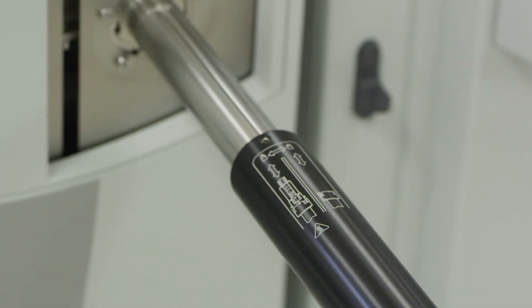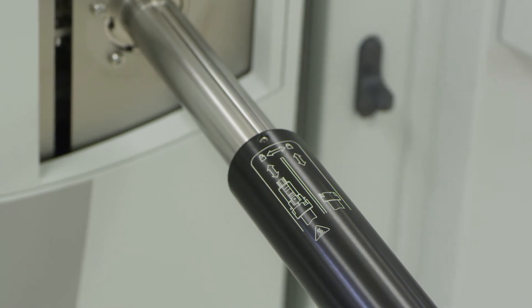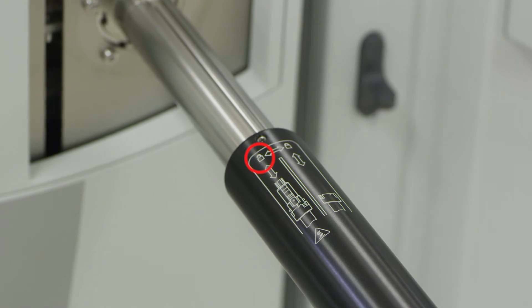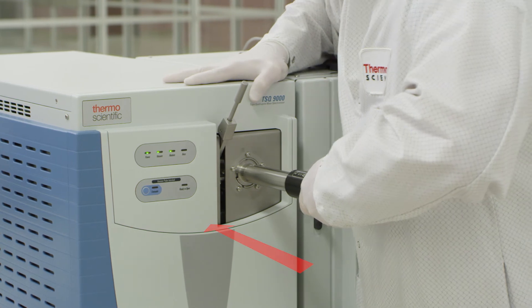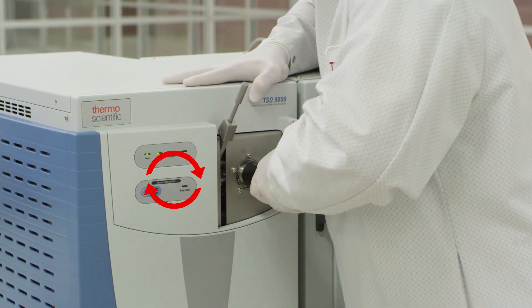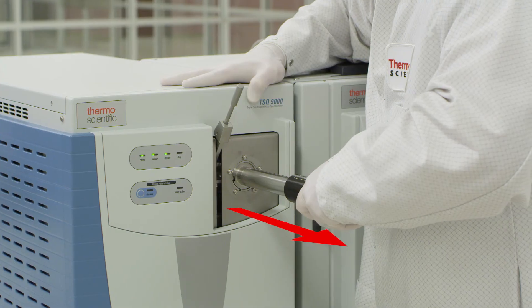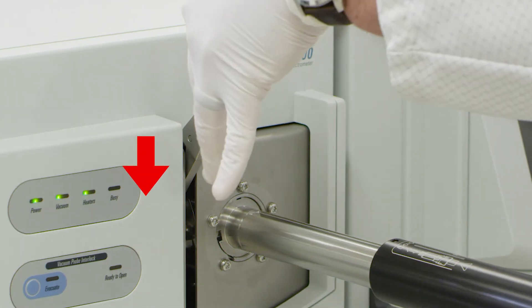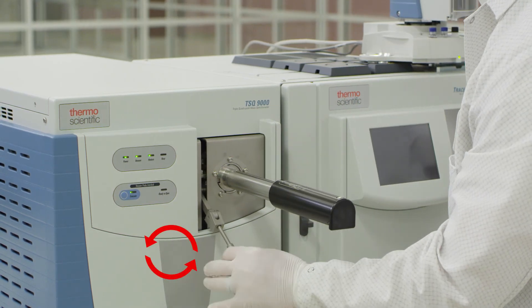Since the source cartridge is now attached to the source installation tool, the indicating screw for the channel guide is in the unlocked position, or left channel. Insert the source installation tool and turn clockwise to seat and release the CI source cartridge. Then pull back on the installation tool, but do not remove. You may now lower the lever, closing the interlock door, and unscrew the lever arm.